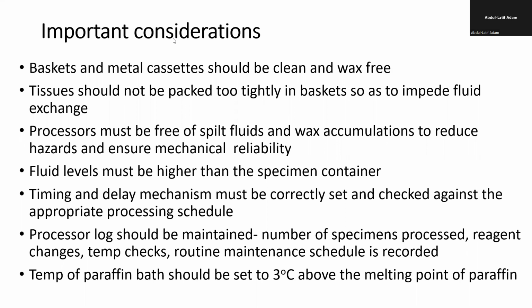And then if you want to delay the processing, it is very important that you check and make sure that the schedule is set for delay. Otherwise, your sample will be processed. You set it on Friday, you didn't set delay, it will be processed, it will be there on Saturday, and then it ends in the infiltration.